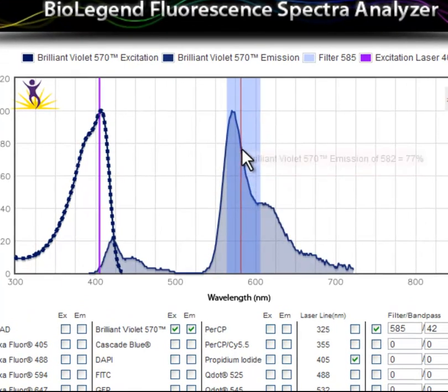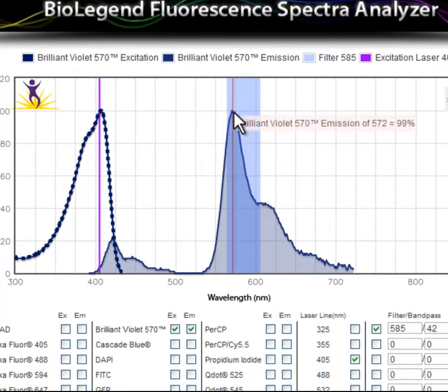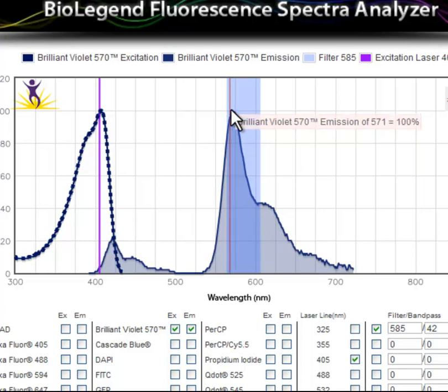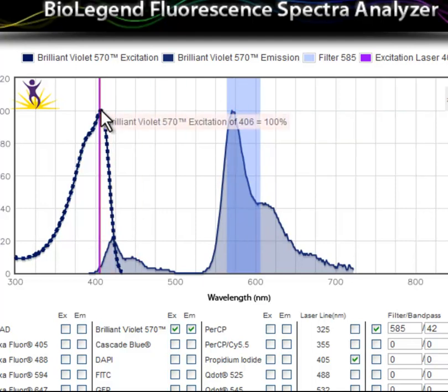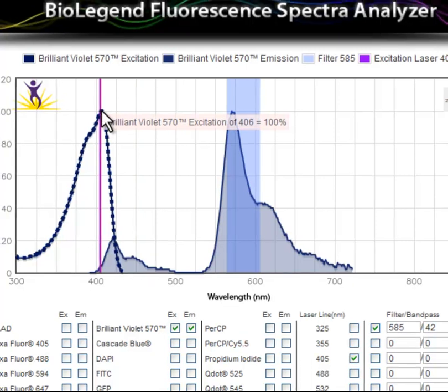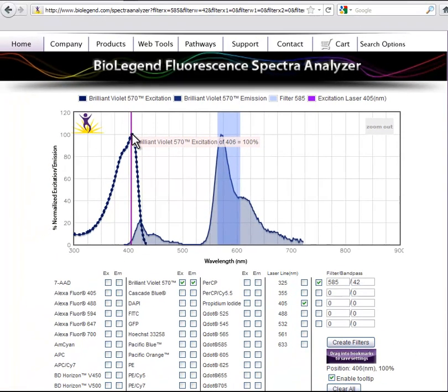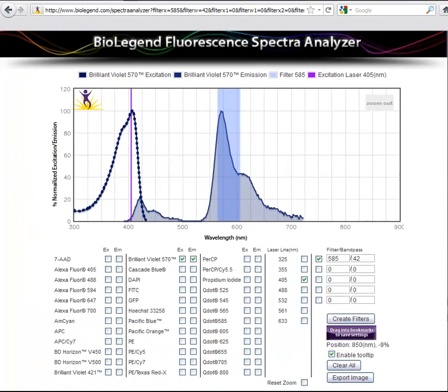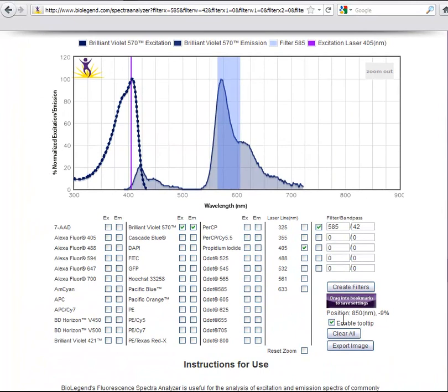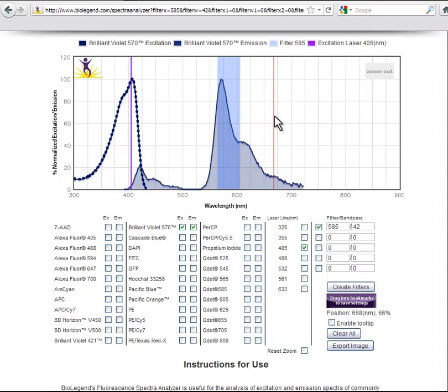The spectra analyzer allows you to view exact data points on any of the graphs. Just scroll over the desired point of interest and a pop-up will appear at the top of the mouse. The pop-up displays the fluorophore excitation or emission, the wavelength of light, and the percent of maximal excitation or emission at that wavelength. You can disable this function by deselecting the checkbox entitled Enable Tooltip.